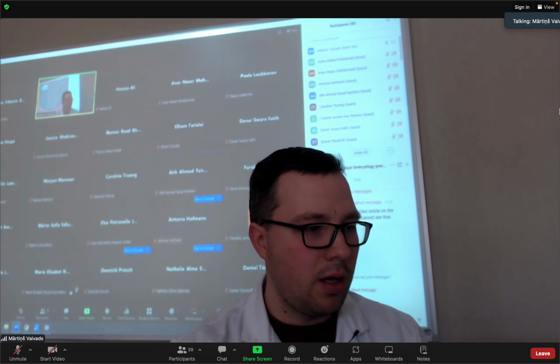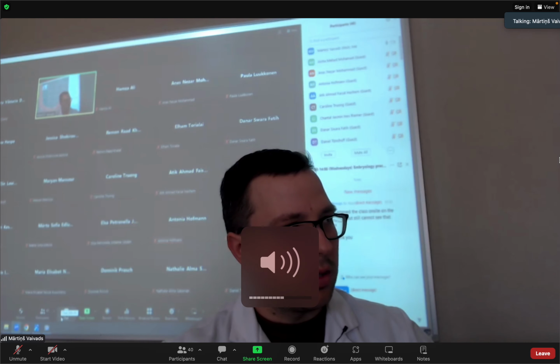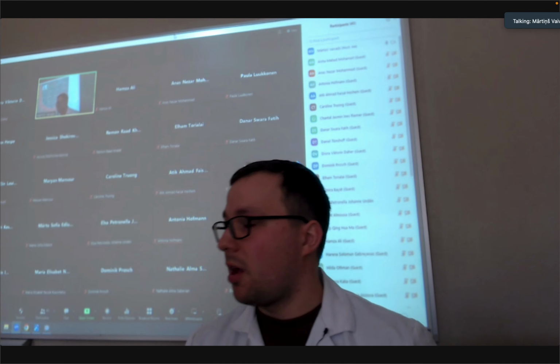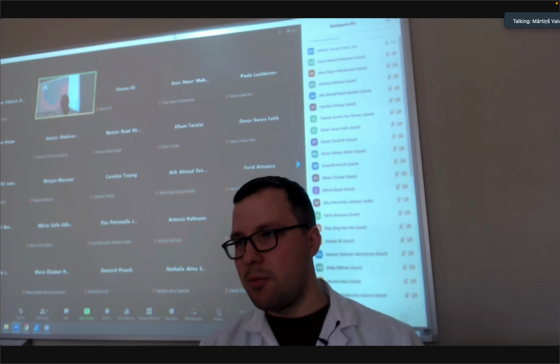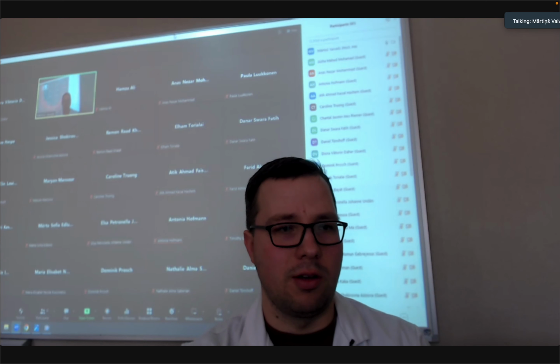Today's topic is about the respiratory system development, gastrointestinal tract development, and nervous system development. There's quite a lot of slides, but I will show you the most common variations and some special cases. You already saw many slides during the demo class, so I will go through the slides that are a bit different, a bit unique in a way.